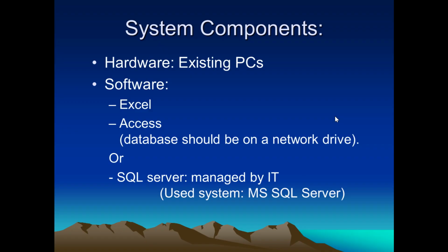If you can get support from the IT department, they can provide the SQL server to you. That will be the perfect setup. First, IT can control the access by domain authentication, which relieves your work.